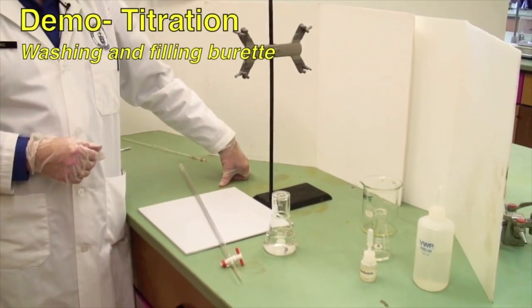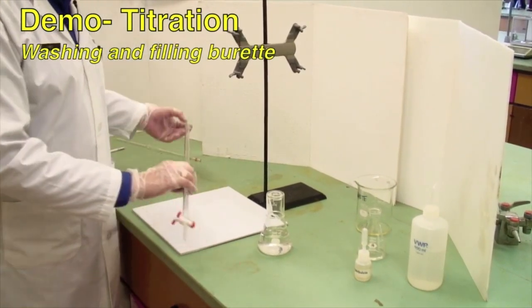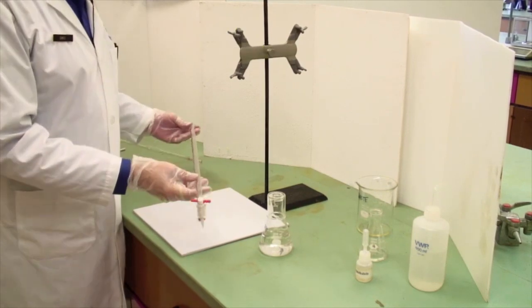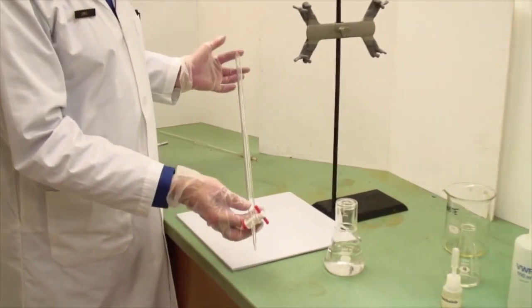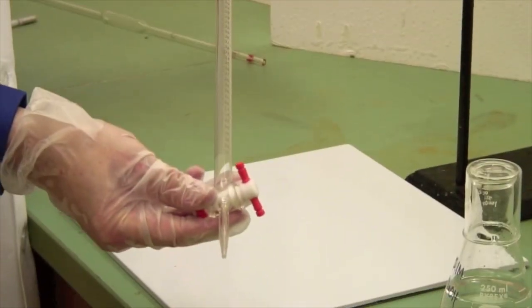Lastly, we come to titration, which uses burettes. Burettes come in various sizes. This one is typical. It's 50 mils long with a tap.